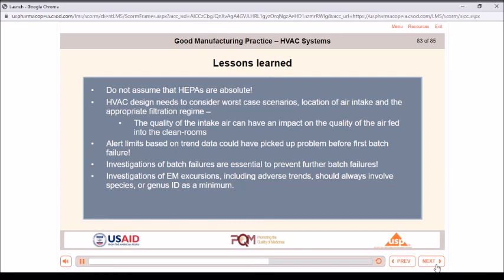5. Identification of contaminating organisms should be performed to species level if possible, and as a minimum to genus level. It is quite common to simply perform a gram stain and look at colony morphology, but this is almost a pointless exercise as it rarely gives any indication of the source of the contamination. Identification of contaminating organisms should be performed not just when an action level excursion occurs, but also when an adverse trend occurs, and certainly when there is a contamination incident.